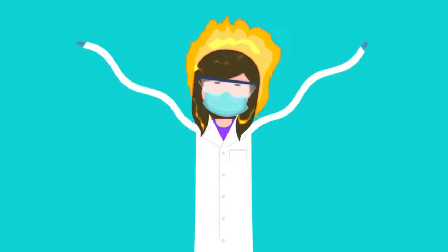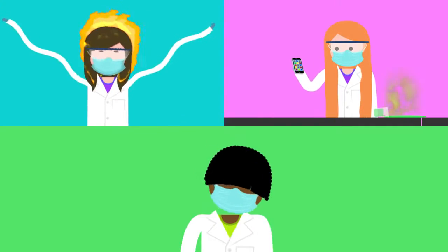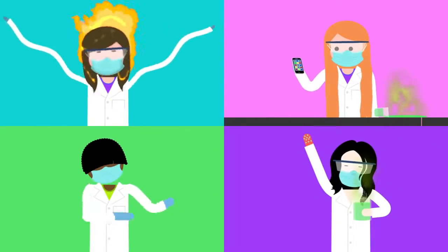Let's start with some very basic safety stuff: your hair. If your hair is long, it shall always be up in the lab. If it is not, it will catch on fire. I've seen it happen. It can also knock stuff over and occlude your vision and droop into your flask. Same thing goes for anything that might hang off your body in the lab. Droopy clothing, especially sleeves, are a total disaster. Clothes should cover your body as much as possible. I like to go long sleeve even.